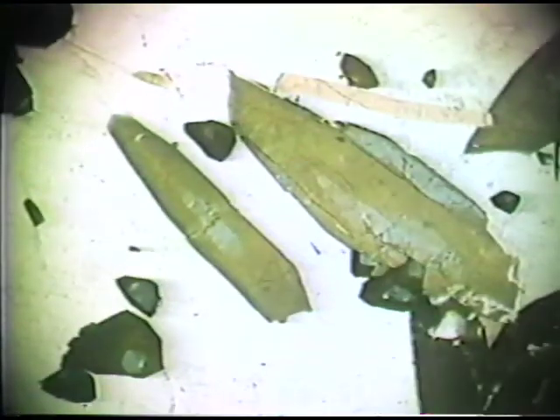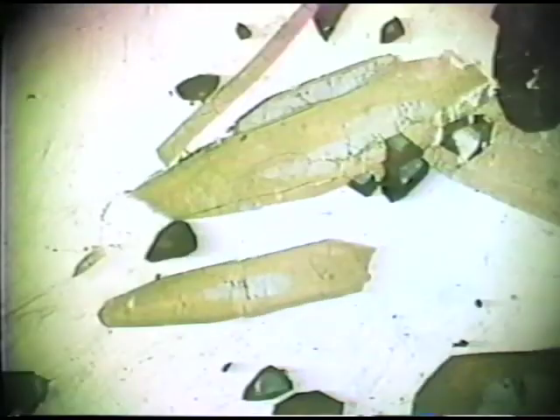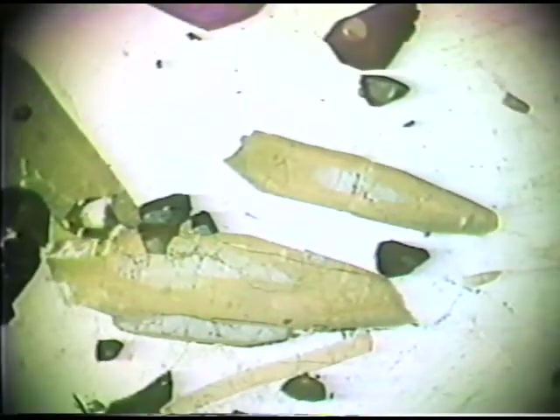plane polarized light, and you can see the pleochroism in these elongated tourmalines that occurs as I rotate the stage. As I rotate the mineral grain, then you can see the color change. The mineral has a very, very strong color in one orientation and a much weaker color in another orientation.